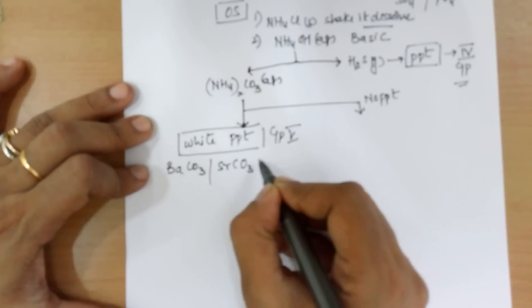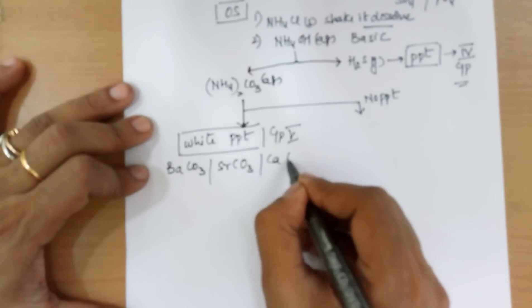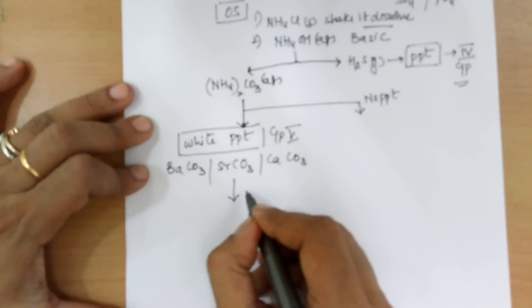The PPTs are of barium carbonate, or strontium carbonate, or calcium carbonate, whatever it is, add acetic acid to it.